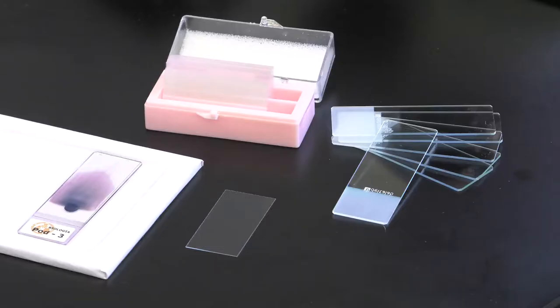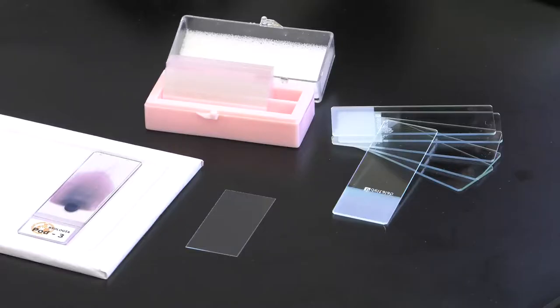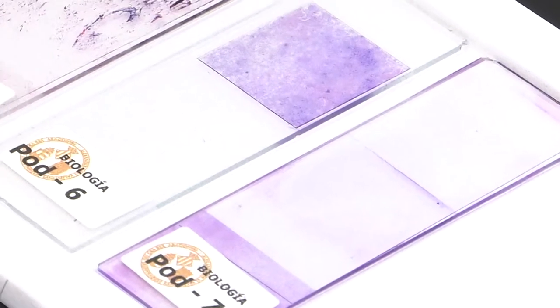It is composed of three elements. The slide is a rectangular piece of glass with a thickness of 1 mm on which the sample is deposited. The sample is the biological material that we want to observe. It is usually a histological section.